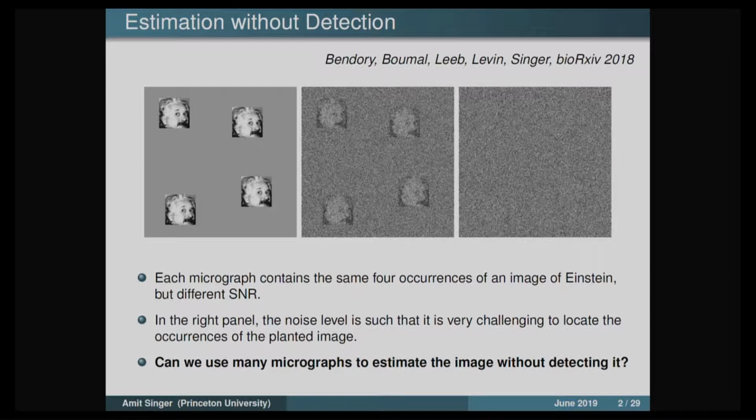So let's now look for another such invariant, and what we'll compute is the autocorrelation. What is autocorrelation? Now I'll take 2 pixels, not just one. I'll multiply their values, and I'll scroll over the image, always keeping the displacement vector between them fixed. So I'm taking pixel x1 and pixel x2, such that the difference x2 minus x1 is fixed, and I'm going through my image. Now I'll get the autocorrelation, and I can play this game for any displacement.